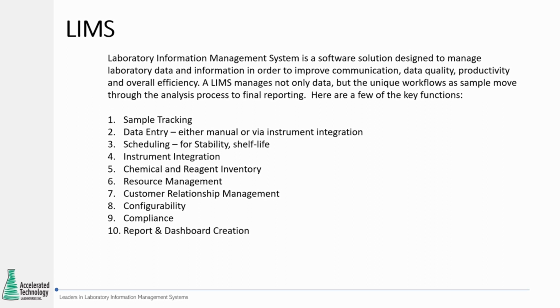This deals primarily with complaints against the laboratory. It allows users to track complaints, how they were received. Was it by email? Was it by phone? Who received the complaint? What was the severity of the complaint? How was the complaint handled? How long was the complaint open? What was the resolution? All of that information can be tracked and managed in the system.